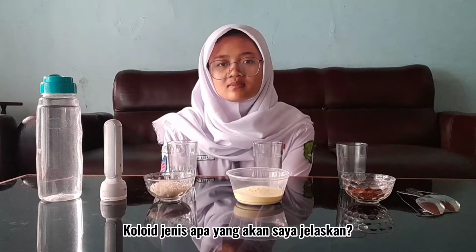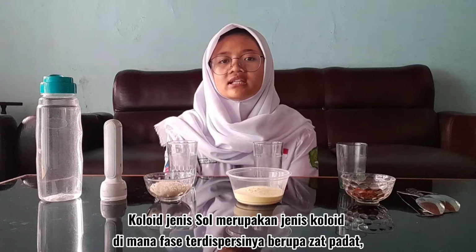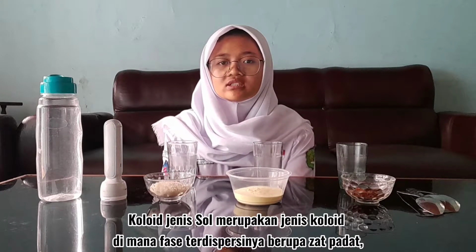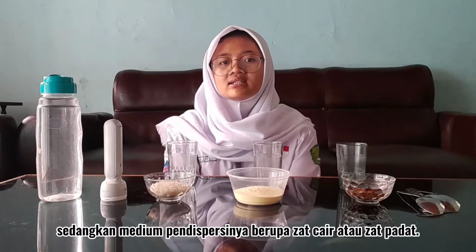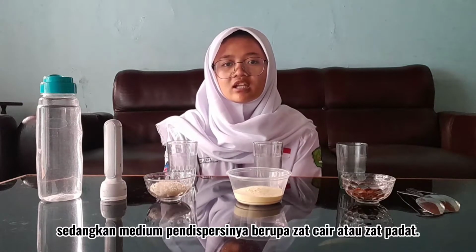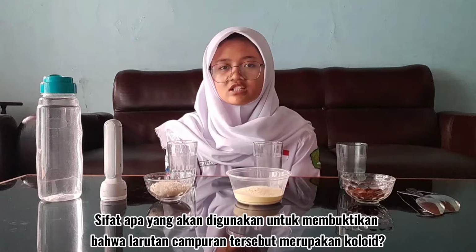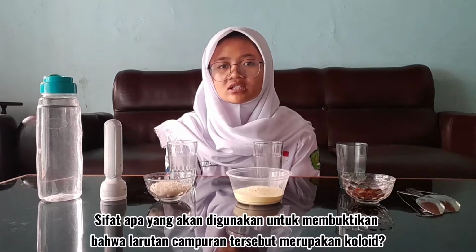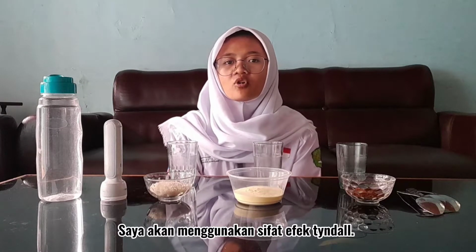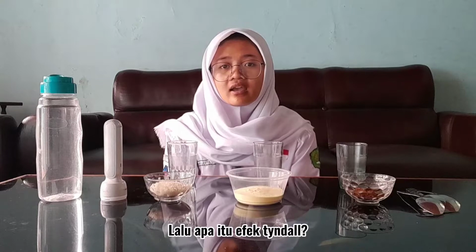What types of colloid will I describe? Sol-type colloid is a type of colloid whose dispersed phase is solid, while the dispersing medium is liquid or solid. What property will be used to prove that the mixed solution is a colloid? I'm going to use the Tyndall effect property. Then what is the Tyndall effect?